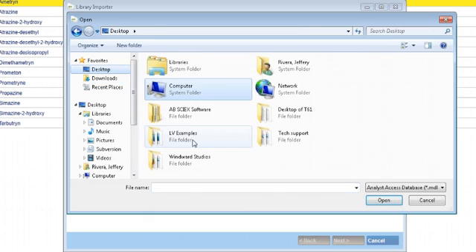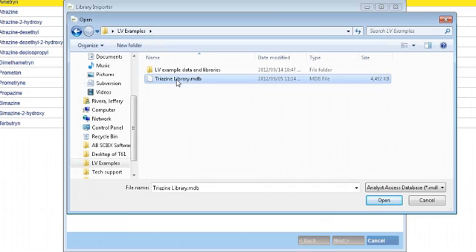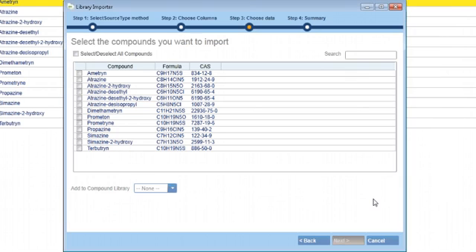Clicking on the analyst compound database button opens the file location window. You can now browse to your analyst library and import it into LibraryView.